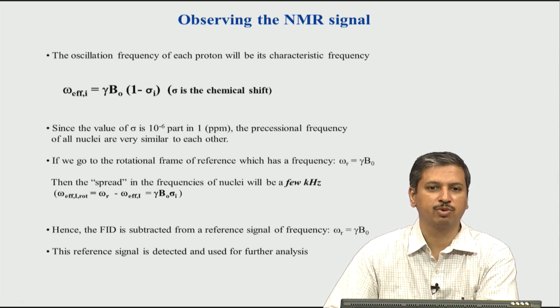So you see, with respect to you, you are at 0 kilometers per hour, because your train is essentially sitting; you are on resonance with your train speed. So you do not experience the movement of your train, but the train which is moving next to you at 95 moves at minus 5, and the train at 105 moves at plus 5.